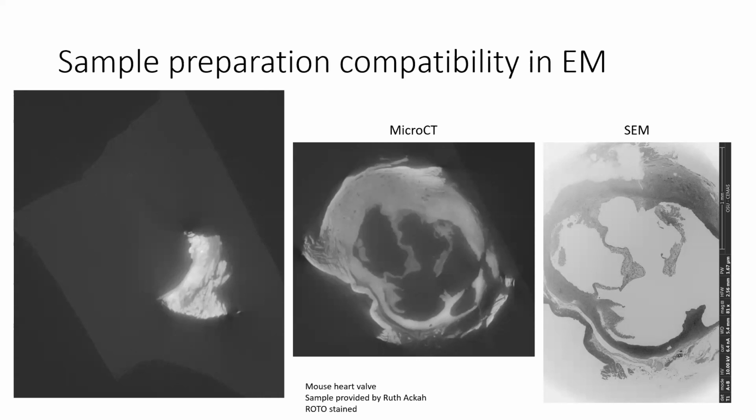So it's first doing microCT, then all sample prep. Sample prep is the same as EM. So I prepared the sample as if I were going to image it for EM. So I did the heavy metal staining and the resin embedding, which can change, but it's conventional EM processing. It can take 3 hours, 5 hours. You have to allow the sample to sit in a heavy metal and be stained.